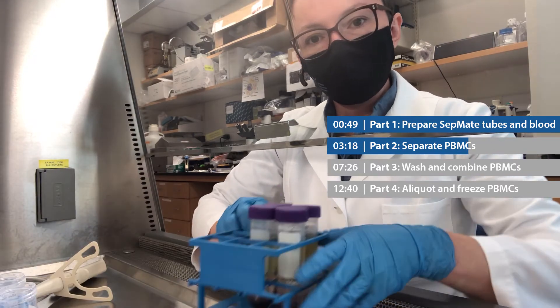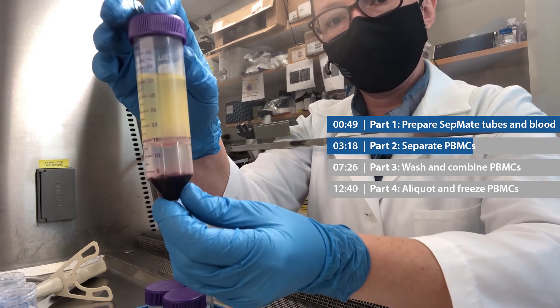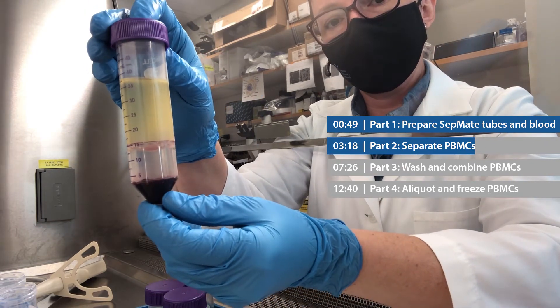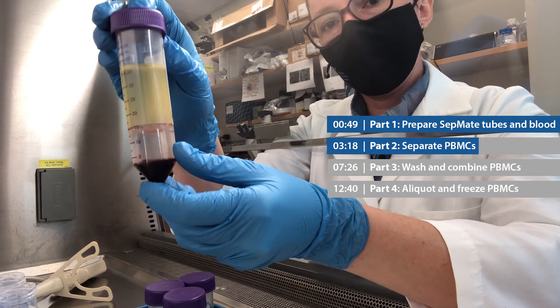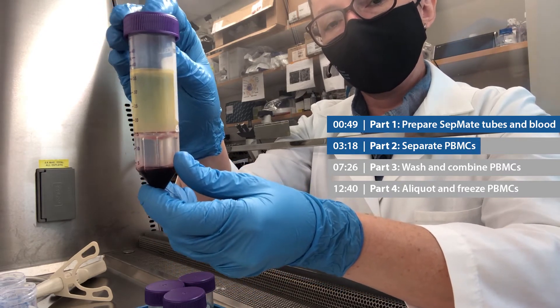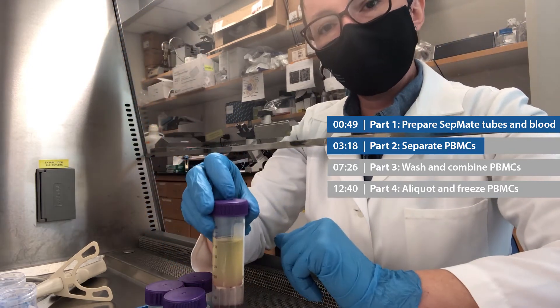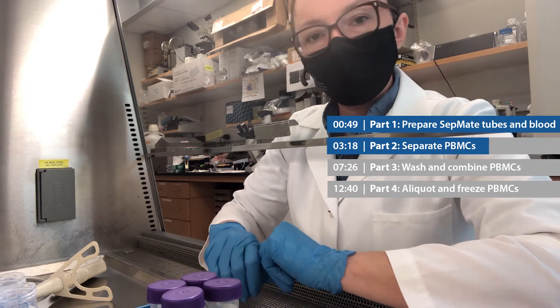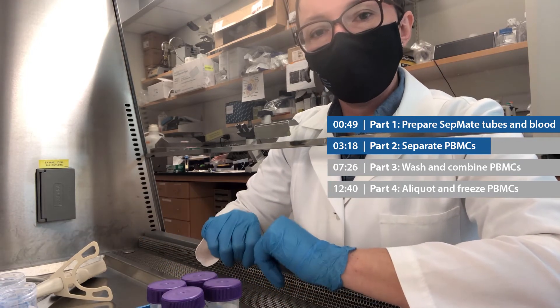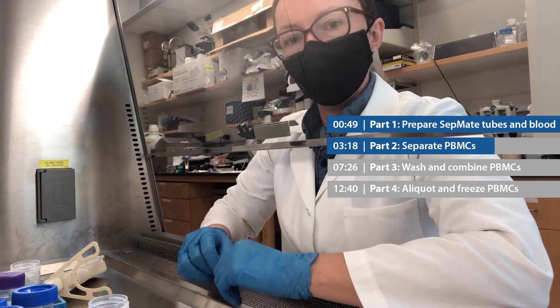I'm back from the centrifuge. Now let me show you what these tubes look like. What you should see is red blood cells pelleted at the bottom, then a clear layer — that's the lymphoprep — and then a cloudy yellow layer, and that's the plasma with the PBMCs in it. The cool thing about these SepMate tubes is that to get the plasma and PBMCs separated from the red blood cells, we're just going to pour it off, and that plastic insert is going to help keep the red blood cells behind.